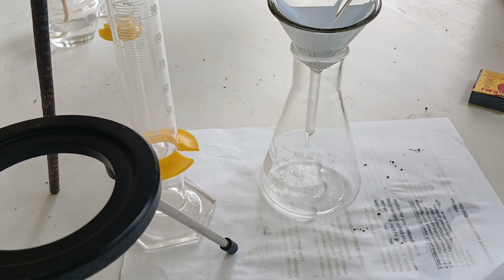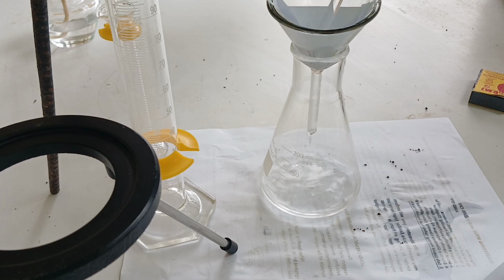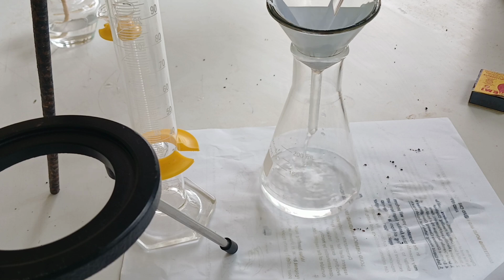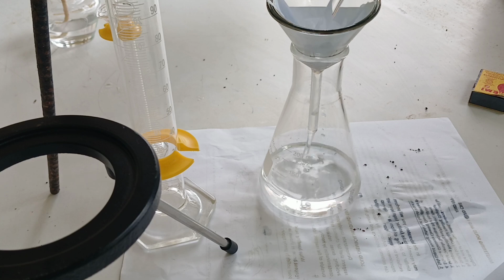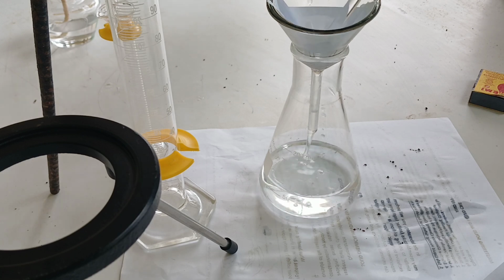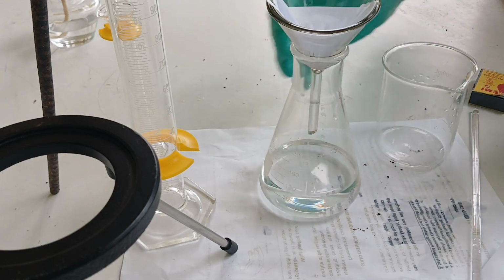As you can see, using again a stirring rod, flowing into the funnel, the filter paper will trap some of the minute particles so that they will not go along with the water. They will be trapped in the filter paper, and you have to use that because that's part of your sample, and recover those solid particles, just like that.